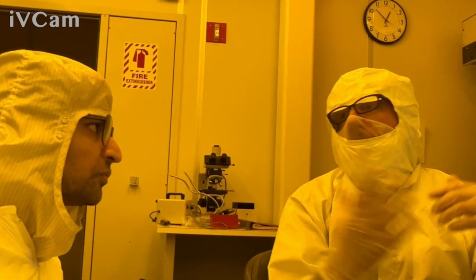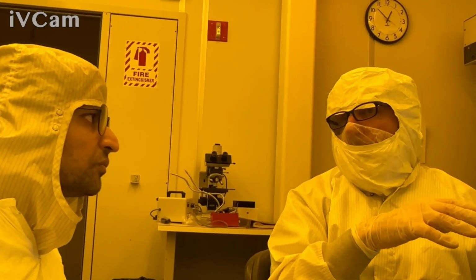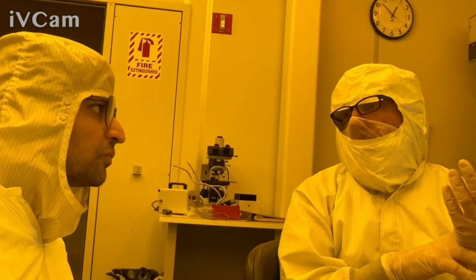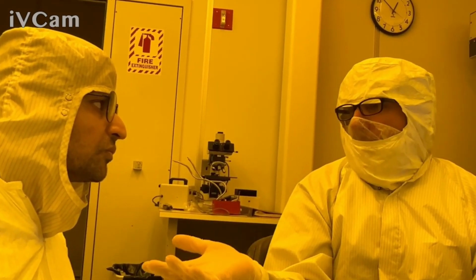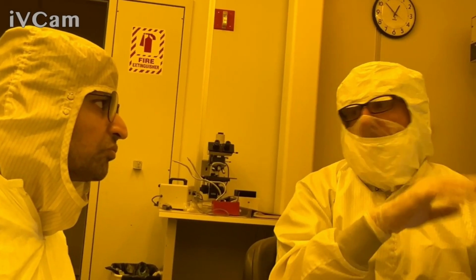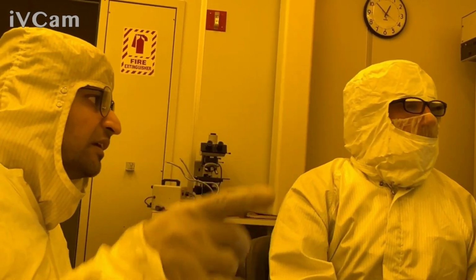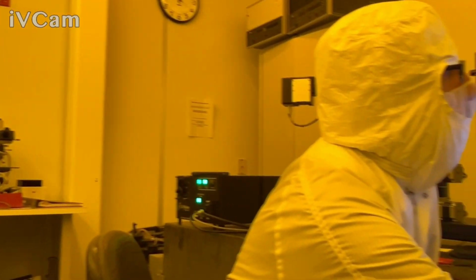If you have roughness on the micron scale, the same as the wavelength of light that we're probing, then that's going to be diffuse and scattering. So that roughness is just going to be more of a loss of intensity. So we're not recording that. But if you have roughness on the nanometers to tens to maybe 100 nanometers, that would also show up in the data. So if you really had a 2 micron film at 100 nanometer roughness, we would see that. So let's just do it here with this data right now.